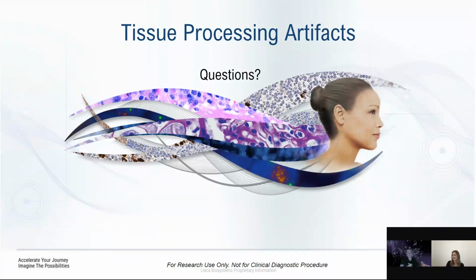Great. All right. Now, next question here. This user is mentioning that they're working in a donor tissue service. The tissue we receive is fresh without fixative. Can we store with Michel's fixative or 10% NBF, which is better?